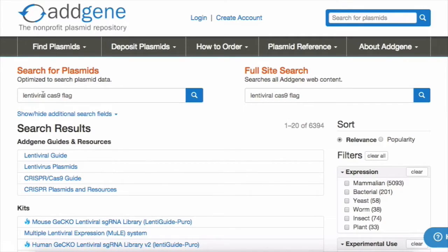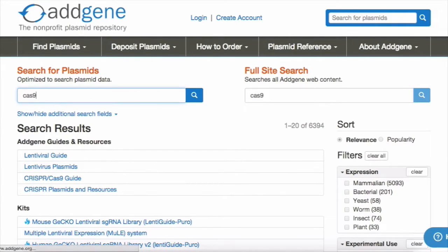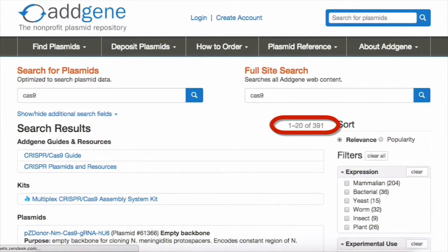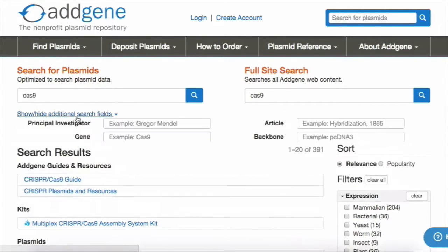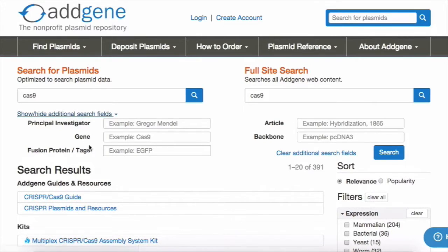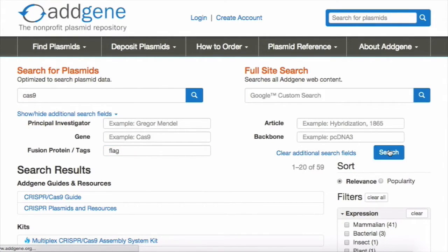Addgene's search results will display items that match any one of the keywords entered. Instead of searching for all of the items at once, let's try searching for only Cas9 — already much more manageable. Now let's apply some keywords and filters to narrow down the list. In the additional search field section, let's enter flag under the fusion protein tags field. This filters the list to only include results that specify the presence of a flag tag.